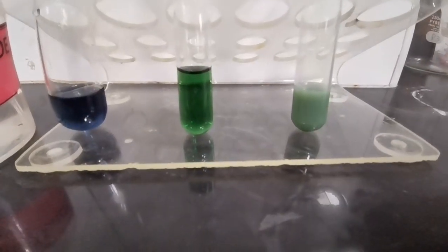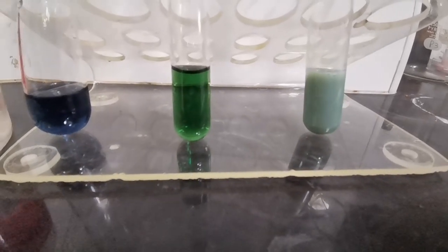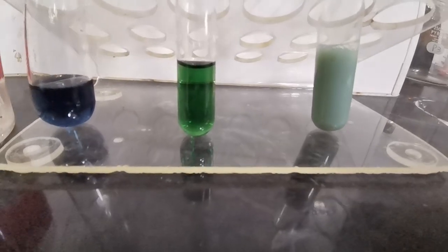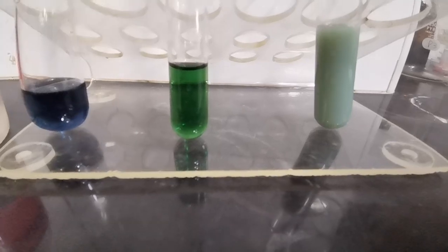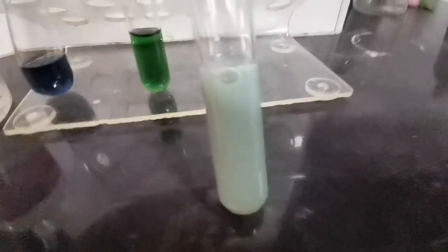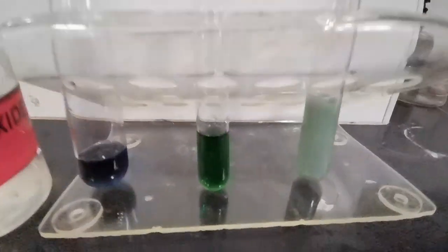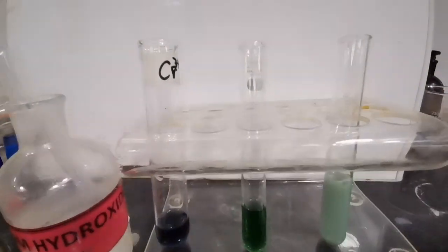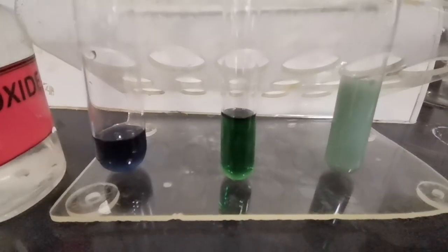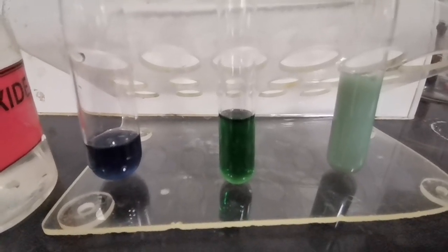Then we add aqueous ammonia in excess. On addition of aqueous ammonia in excess, more of the precipitate is being formed because whatever chromium ions were left that did not react with ammonia are now forming a precipitate. So on addition of aqueous ammonia in excess, the gray-green precipitate remains and is insoluble. In summary: NaOH gives a green solution, while ammonia gives a green precipitate.